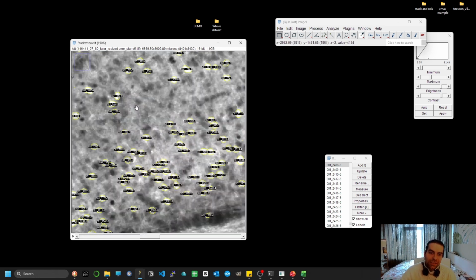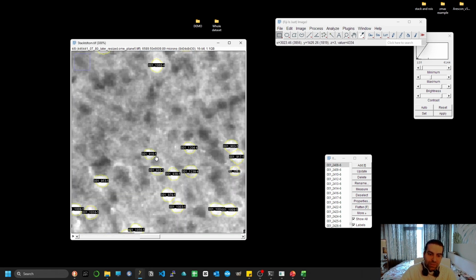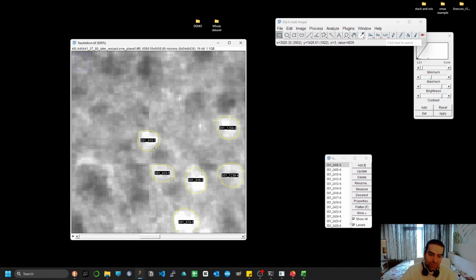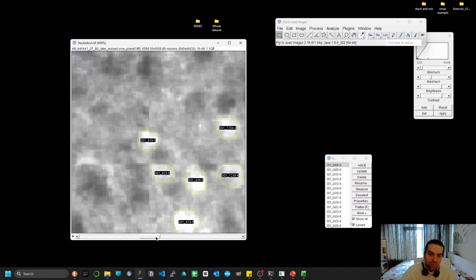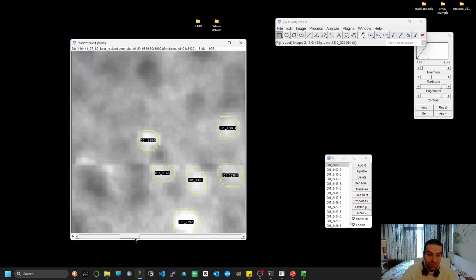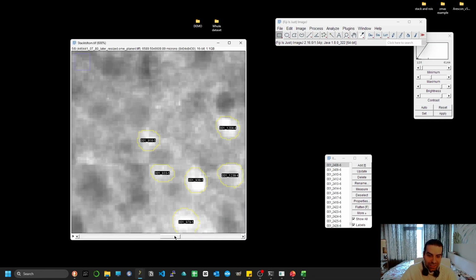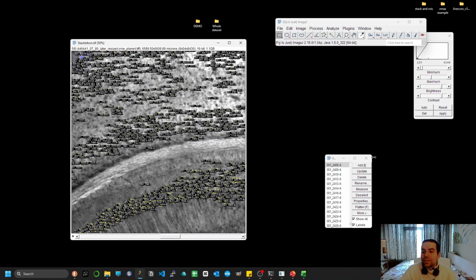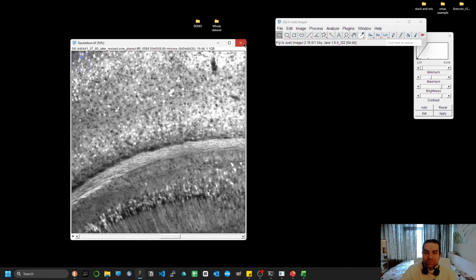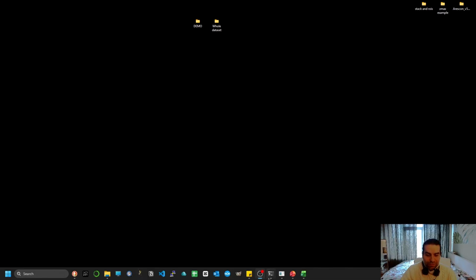You can see at the end of the names, as I also mentioned in the first video, this indicates where Arescon believes that the most clear version of a neuron is, based on these dashes here. Cool. Now let's jump to the new stuff.